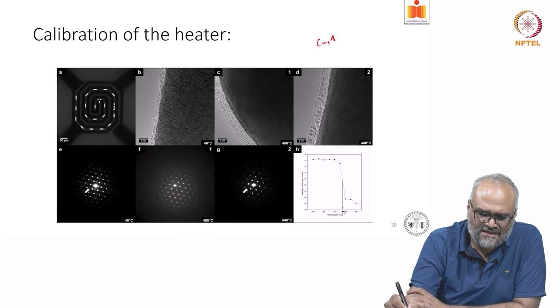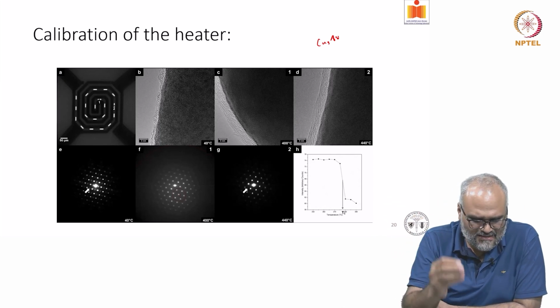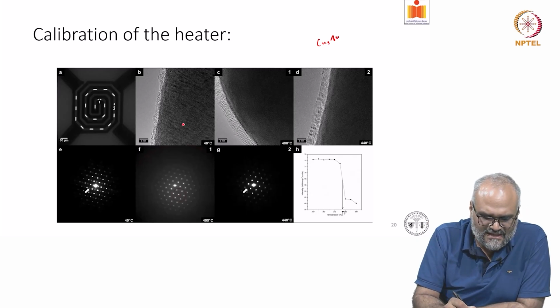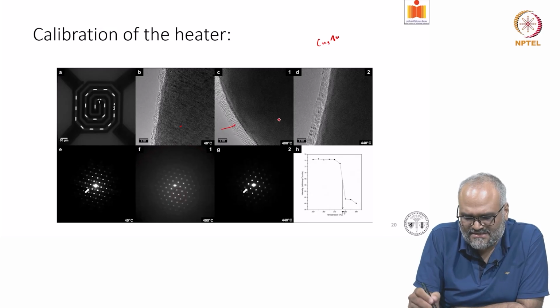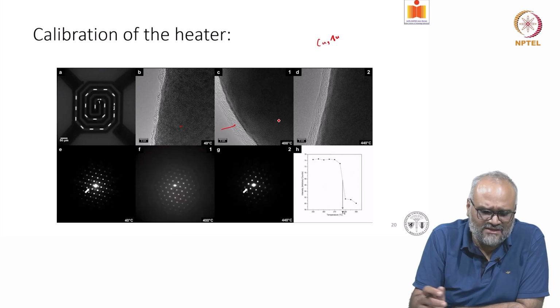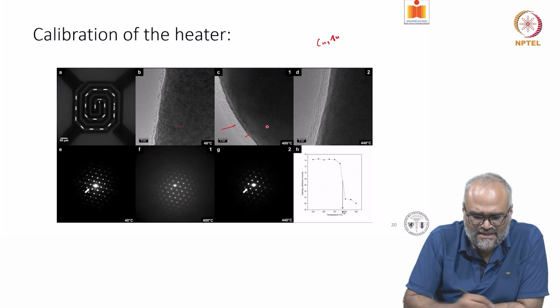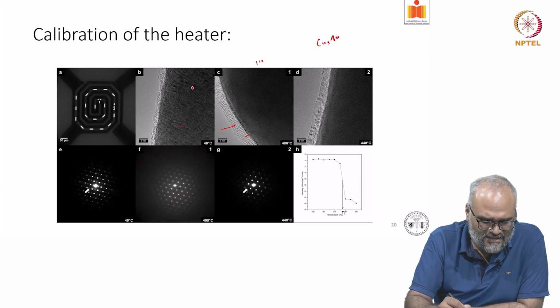It has order-disorder transformations, and at room temperature it is more or less an ordered structure, and the ordered structure appears like this. And when you start heating to a higher temperature, at 400 or beyond the critical transition temperature for this particular order-disorder transformation, it actually becomes a disordered structure, which appears like this. So here you can see this is appearing like Cu3Au oriented along the 110 direction, and over here as well.